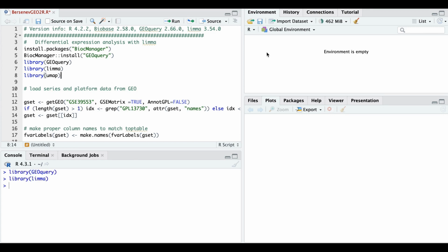And when you have such a small number of samples, you do not really need UMAP, believe me. It is needed only if the number of samples is, let's say, approaching 100 and more, then UMAP will be helpful. If it is a handful of samples, there is no point in using it.